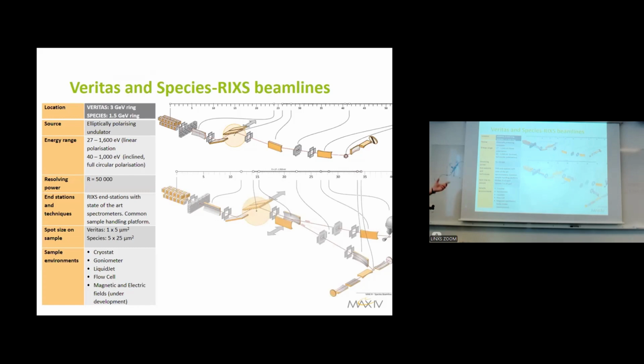The good thing here, for RIXS purposes, is it can go to low energies. So if you want to look at other things like sulfur, you can find sulfur L, for instance, at species, which can have some uses. The drawback is, of course, you get very surface sensitive. But we have a high resolution, high throughput, low energy instrument in the works there.